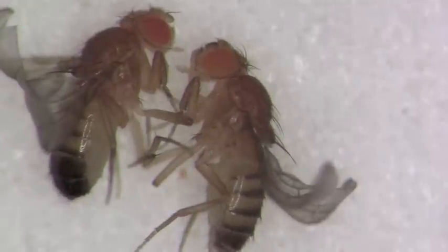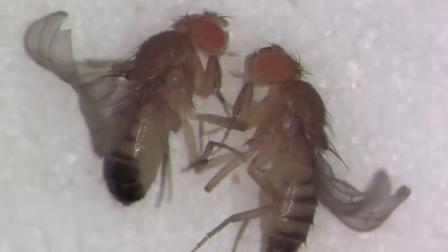Here you can see the pigmentation differences between the male and the female in the posterior end of the abdomen.